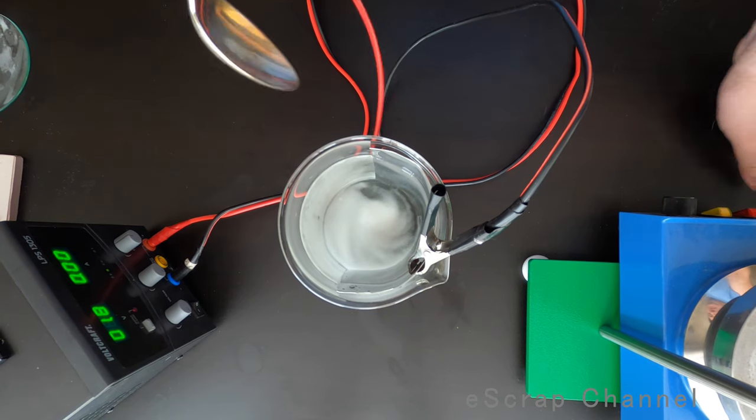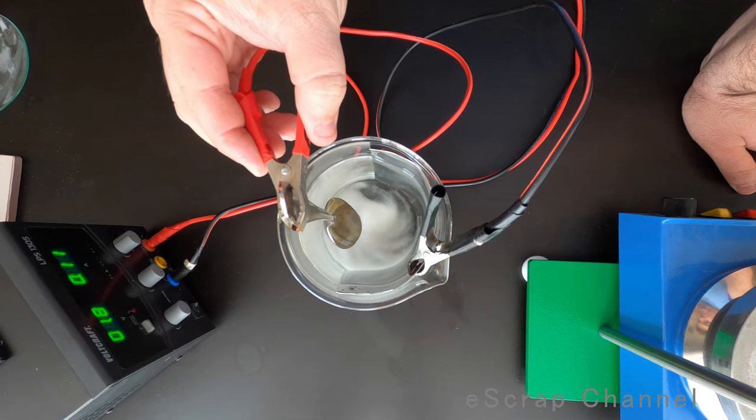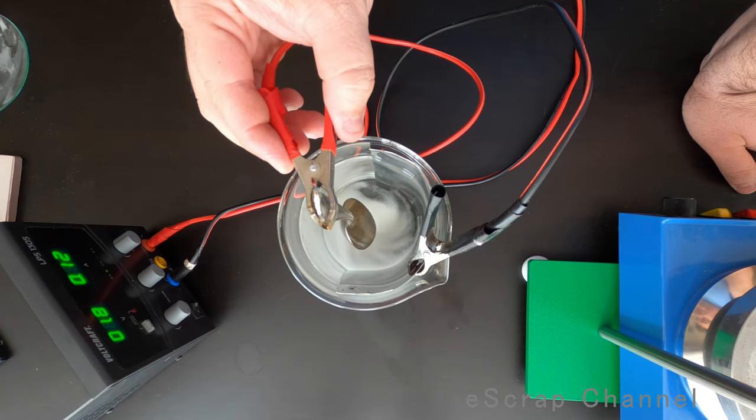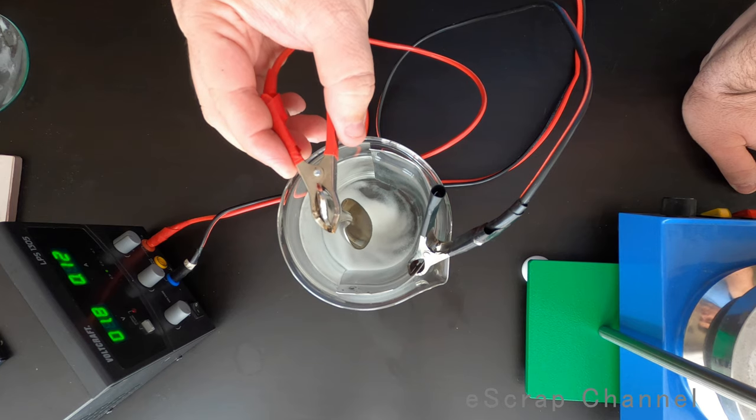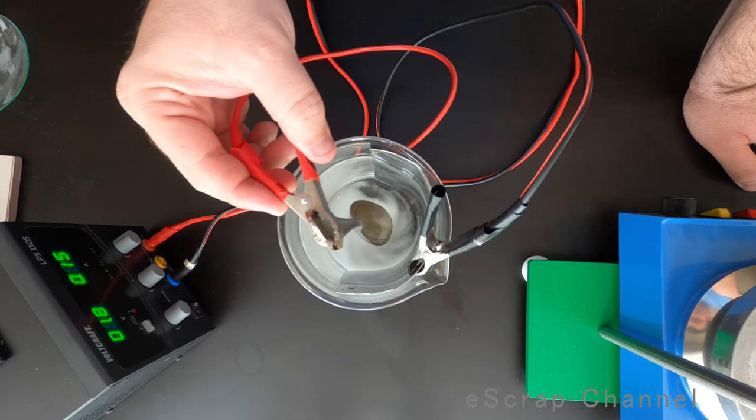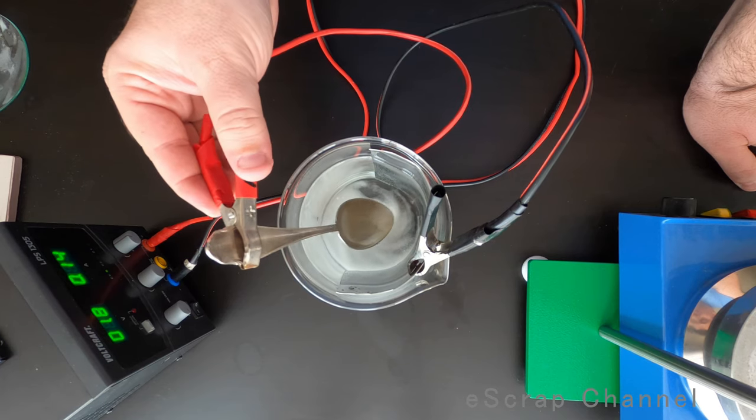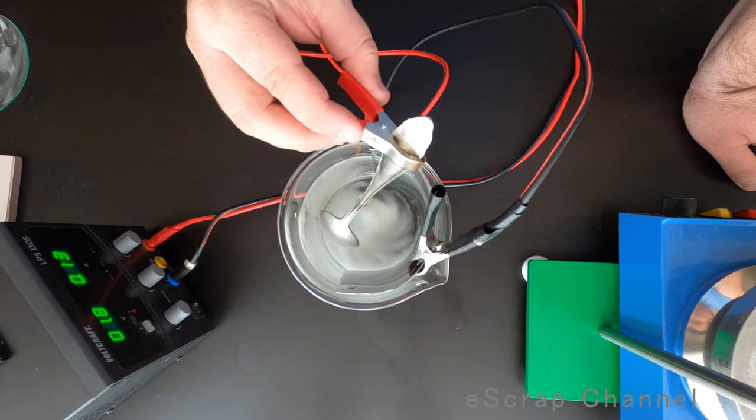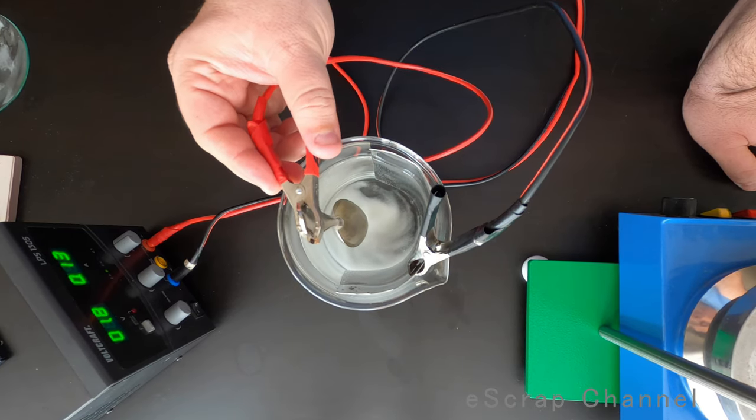And next step is to put inside our silver plated object. Immediately reaction starts and you maybe see that I have 0.13, 0.14 amps. So what is happening now? We have our silver going into the solution and we are removing the silver. We do the opposite of silver plating. That's why we call it silver reverse electroplating.